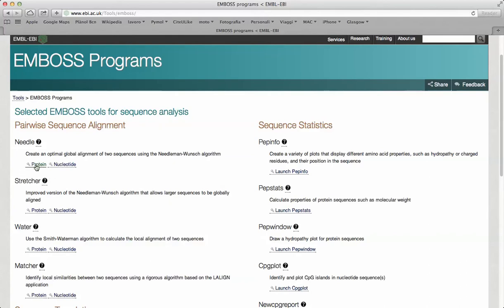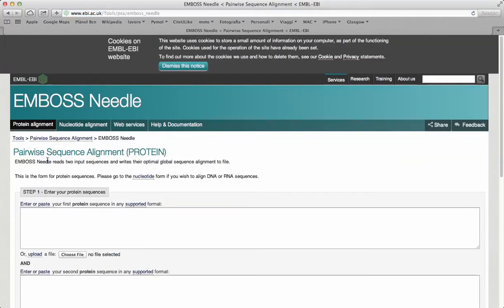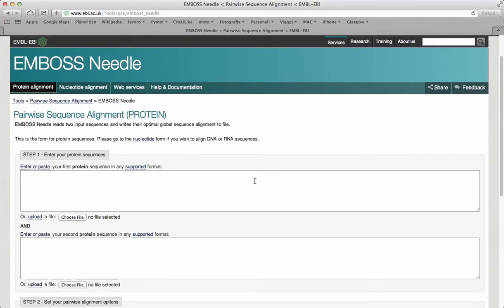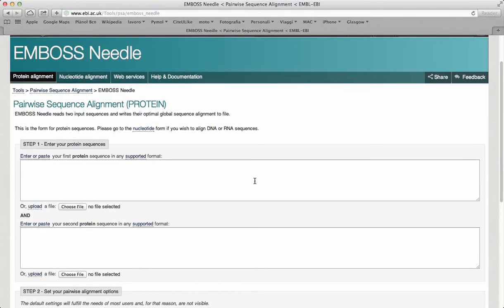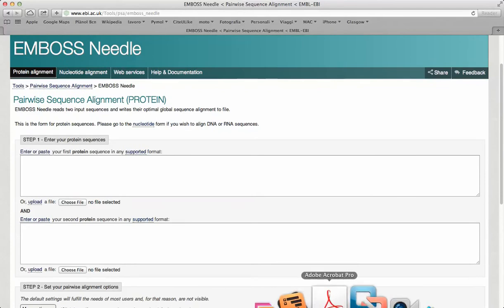Let's start doing a global alignment of two proteins. The first step for conducting alignment is to enter the protein sequences.